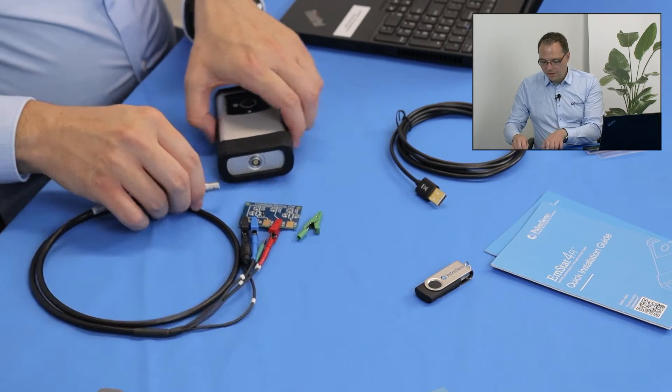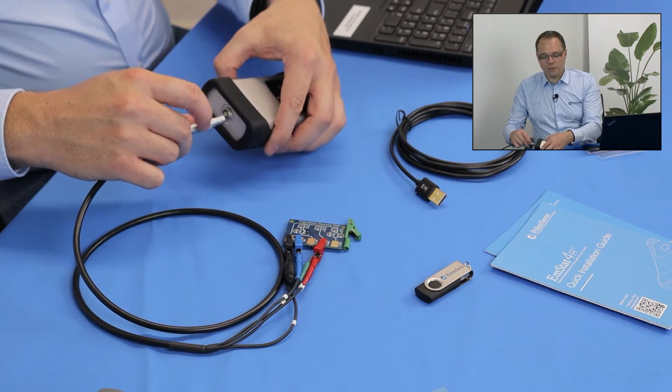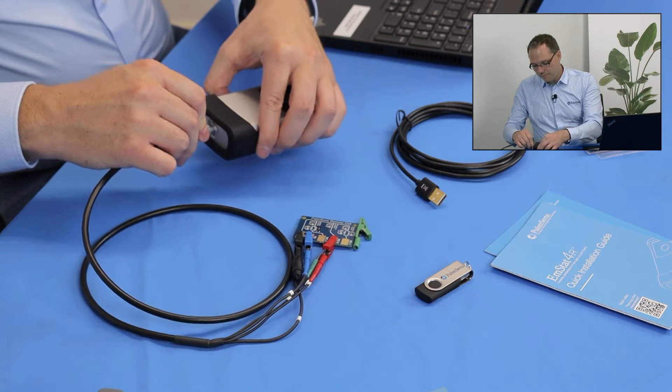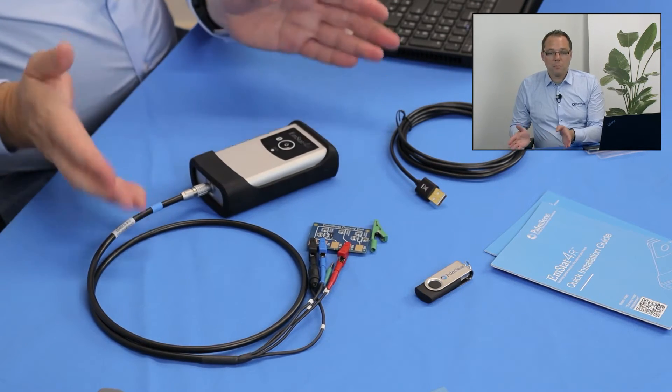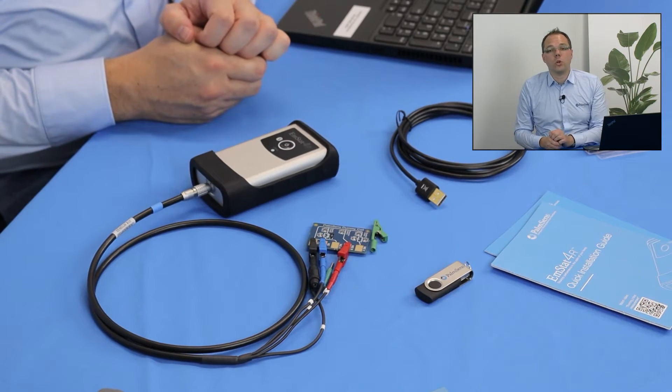Then I connect the potentiostat. Just make sure that the red dot points to the top and then you can just push it in. Before we can do a measurement, we of course need to switch the potentiostat on. For that we just press the button and the ring around it illuminates so we know it's switched on. Great, now we've set up our physical experiment. Now we need to get to the software part. So let's have a look how we set up the measurement in the software PS Trace, which I've already installed and opened on my laptop.